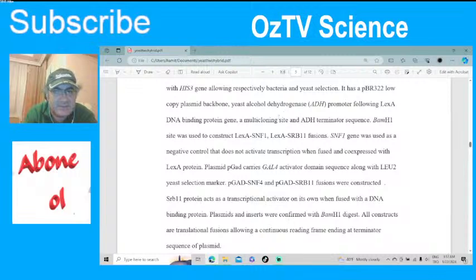That's what it does. You clone the gene here. That's why it's called a multi-cloning site. So this is the second construct, third construct, and then this is the fourth one, the pGAD SERB11.